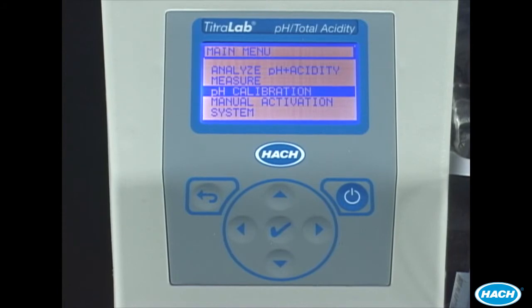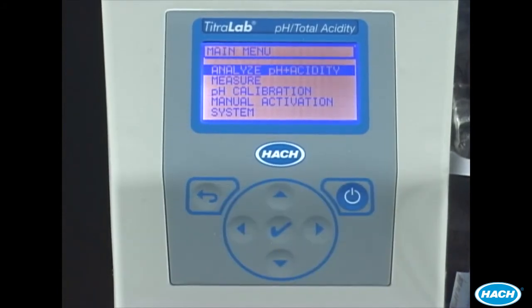Select Analyze pH and Acidity and press the check mark to start the analysis.